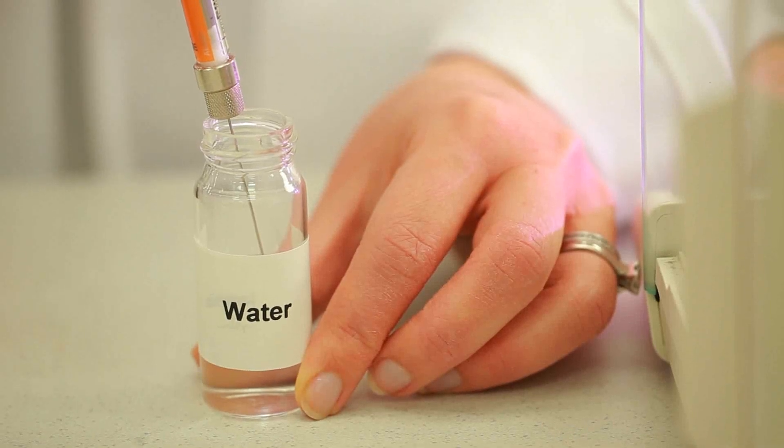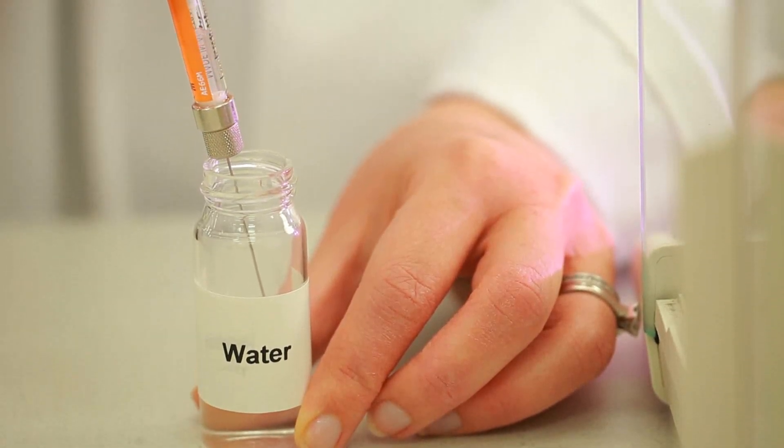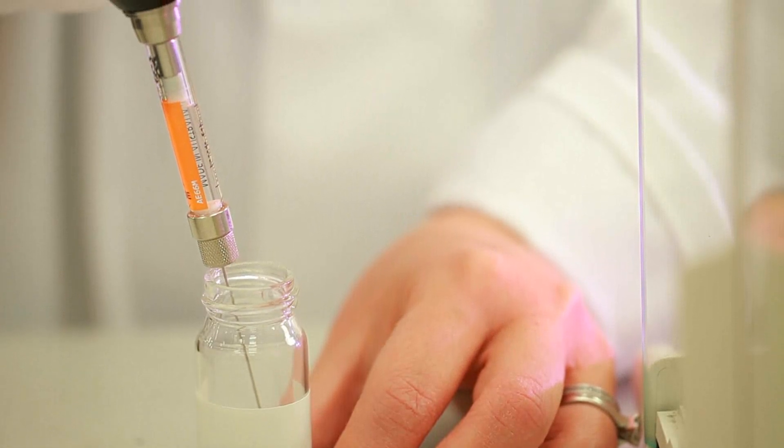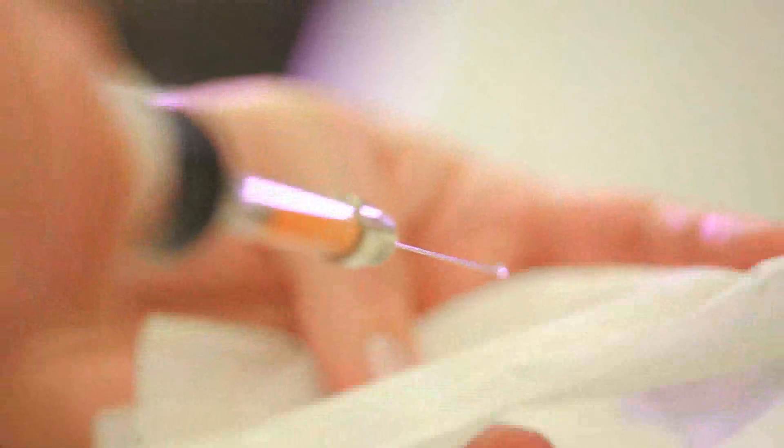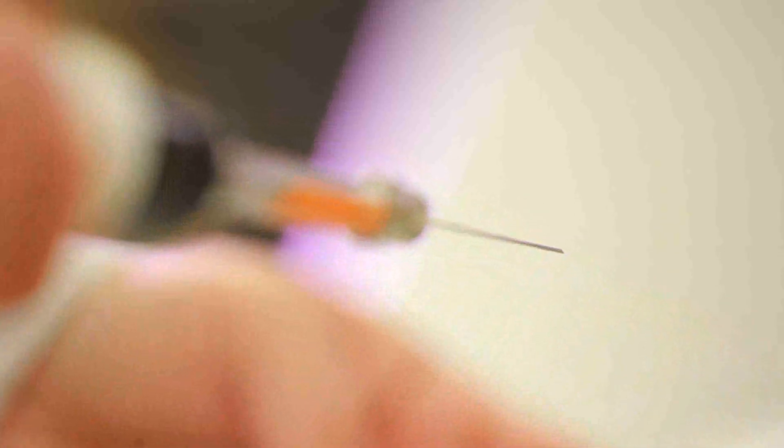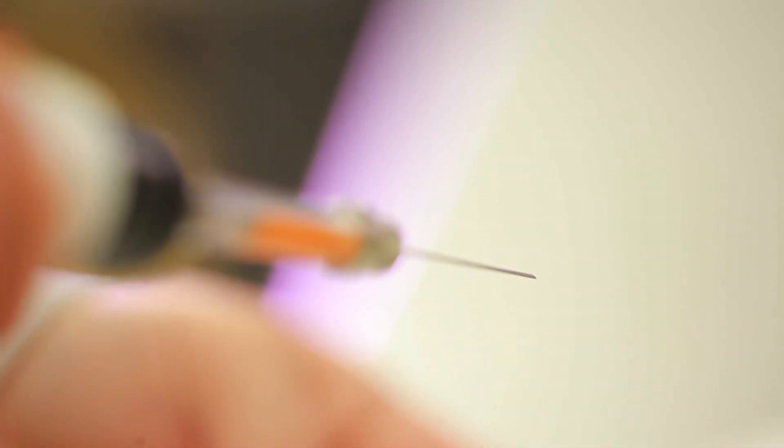After setting aspirate volume and the aspirate and dispense speeds on the EVOL, aspirate the calibration liquid into the syringe. Then wipe the outside of the needle tip with lint-free tissue, making sure no drops of liquid will remain on the needle tip when weighing the dispensed liquid.